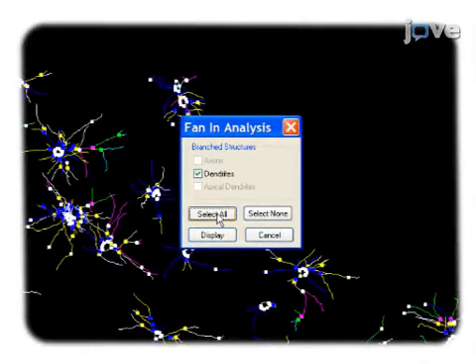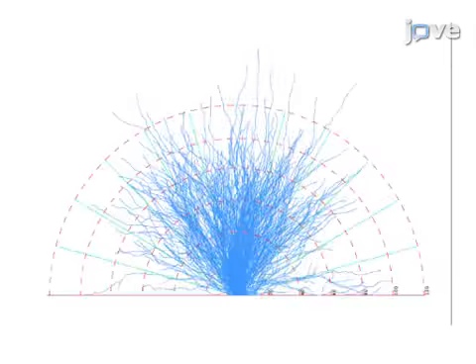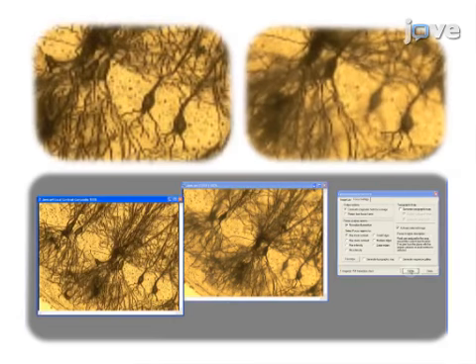Following tracing, the entire dendritic tree can be reconstructed and analyzed using the fan diagram. Analysis of various fan diagrams derived from different mice can be used as an objective means of comparison. The second method is to visualize dendritic arborization with extended depth of field imaging.